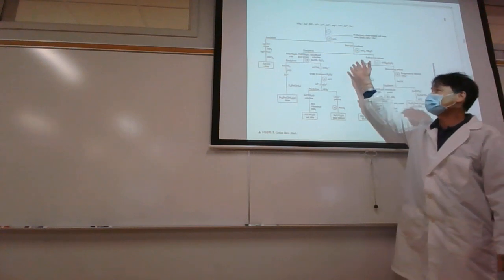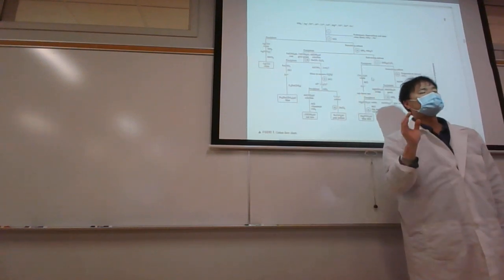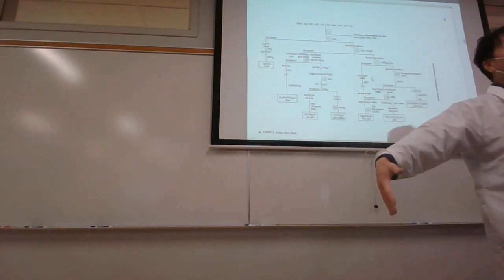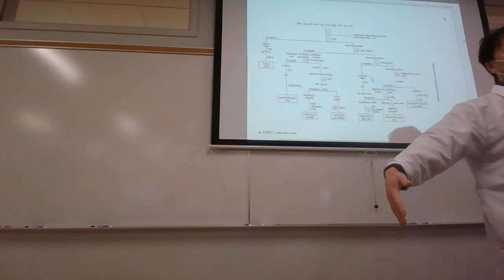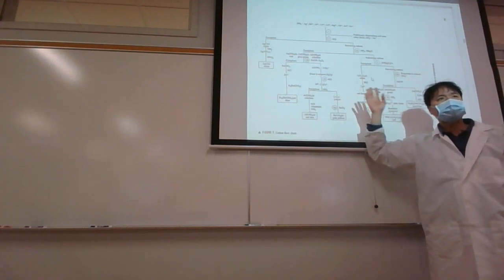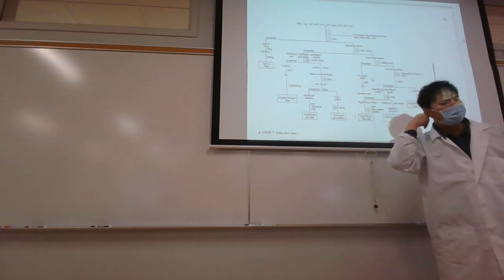So, for example, how much HCl do I add? Well, if you read the procedure, the HCl is one size fits all. If it's one size fits all, they're going to get the biggest size and make everybody wear that, right? And this is how come people, when they get to the end, they're following the procedure. They said, I followed the procedure exactly. Well, unfortunately, it didn't quite work out so well for you.